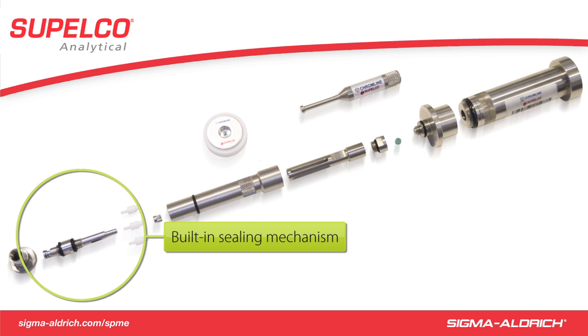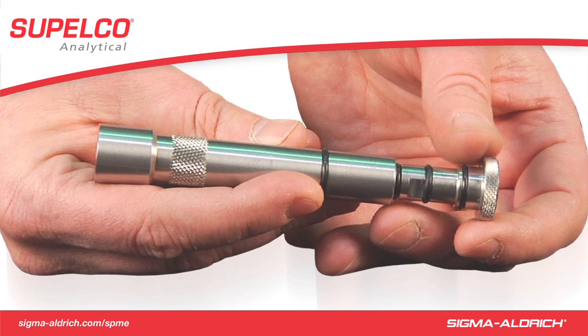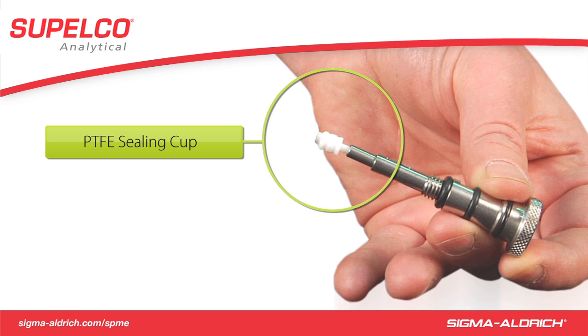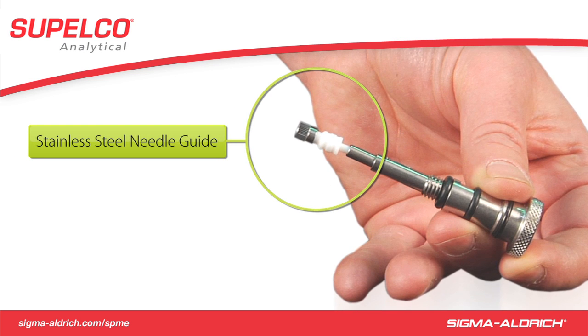This allows installed FFAs to be shipped to and from the sampling site without loss of fiber conditioning and without compromising the sample. The built-in sealing mechanism is composed of 3 parts: the spring-loaded sealing assembly, a PTFE sealing cup, and a stainless steel needle guide.